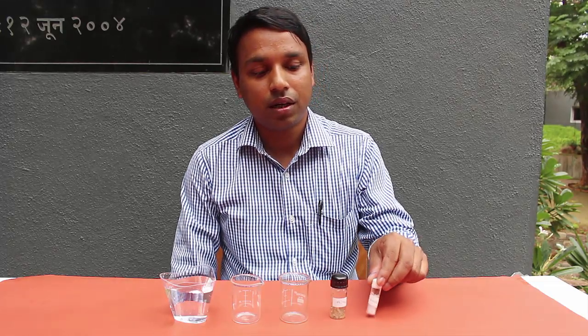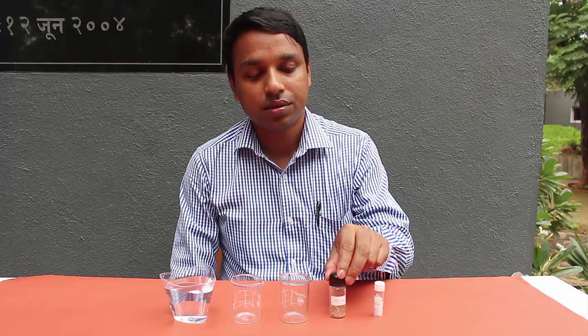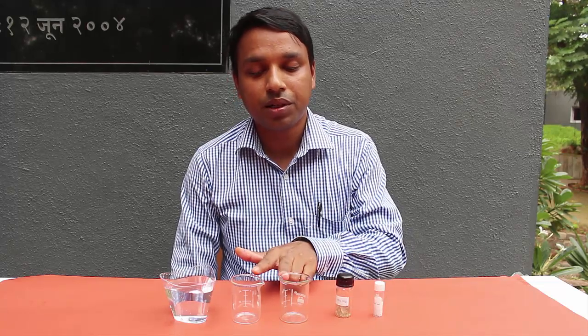Hello friends, today we are going to prepare artificial blood. This is a very amazing chemical reaction. For this we need some chemicals: ammonium thiocyanate, ferric nitrate, two empty beakers, and a glass full of water.